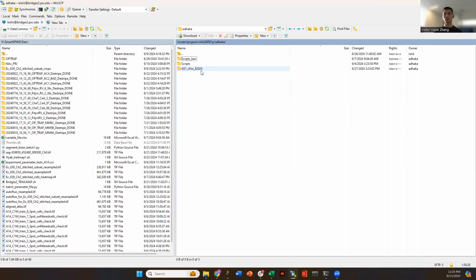And if you can say that, okay, in these two approaches, this cell was counted the same in both ways, this cell was only counted in manual but not in ClearMap, this cell was counted in ClearMap and not in manual. You'll get that information if you have two separate lists of cells that you think are cells from the two approaches. From that, you will be able to generate something like a false positive rate, a false negative rate, right?